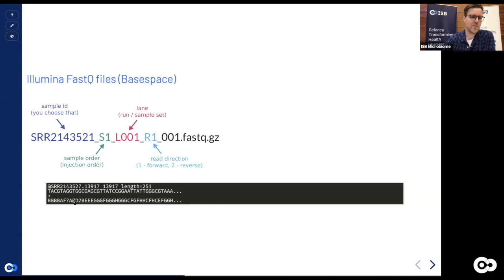So what they do is they encode every quality score, and quality scores usually go from 0 to 40, for instance, with a single unique letter. So you could say that B is lower quality than C and D is higher quality than C. And then they put that underneath the read. So now it's obvious that this first nucleotide has a quality score of B, which might substitute into a quality of 20, for instance. So that's the data that you get.